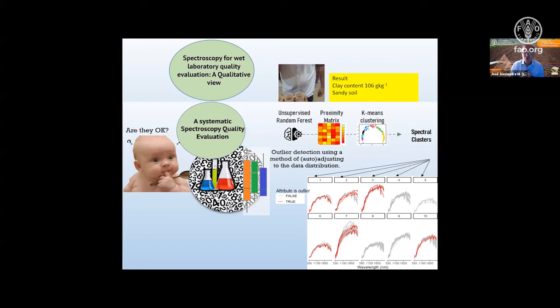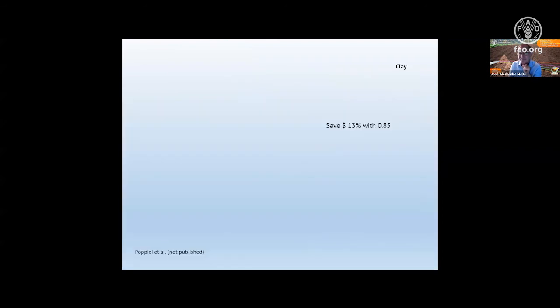So we are doing this to make things faster. You can run all your analysis and see, oh, this spectrum is showing a soil analysis that is not correct. Let's remake it, but by spectra.